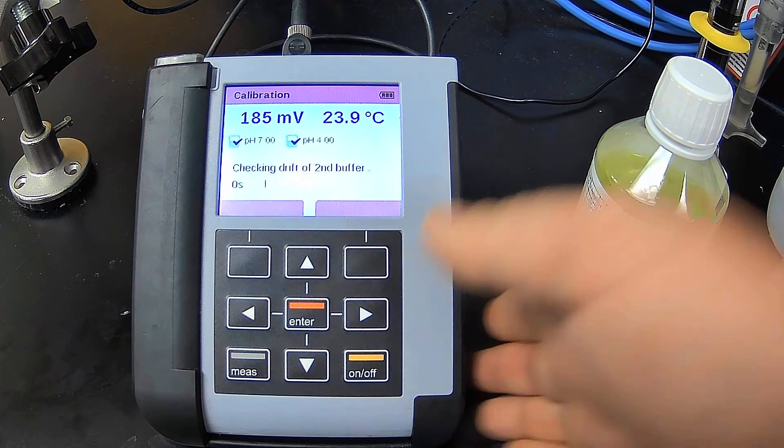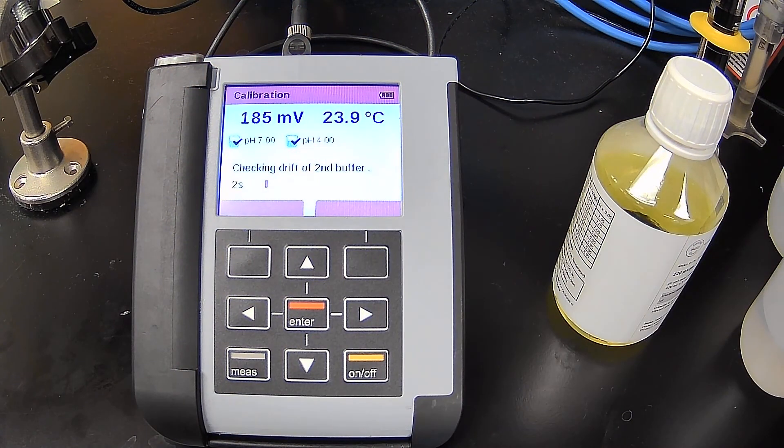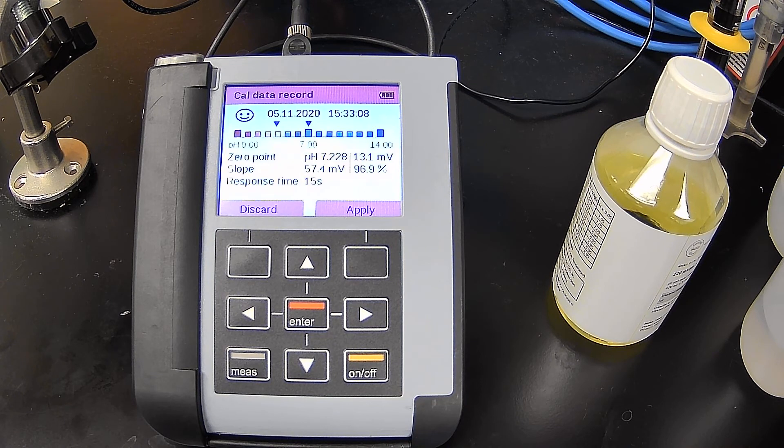So I hit continue. And it's going to start the second calibration for the second buffer, which is a buffer 4. So again, we've already calibrated the ORP.